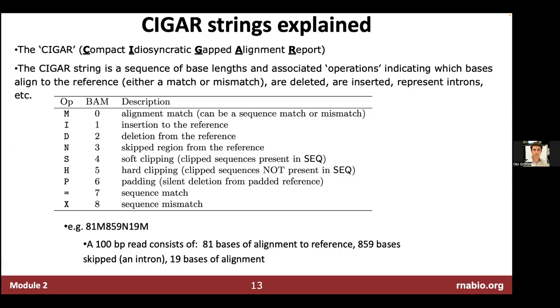Typically, for a structural variant like a translocation, if you looked at your BWA MEM alignment and your read, it would match where, say, chromosome one is, and then at the point where it stops matching, the read is still there, and you get mismatches. Those would probably be soft clipped, and represented in the CIGAR string as a series of soft clip bases. Then there would be another read, probably on the other chromosome, that had the inverse of that situation. And like Malachi says, you need to run a special tool that spots that pattern. It's like, oh, there are these two regions of soft clipping, and maybe they match up, and you can realign the part that didn't match to figure out where the translocation is. But it's not natively supported in the BAM file.